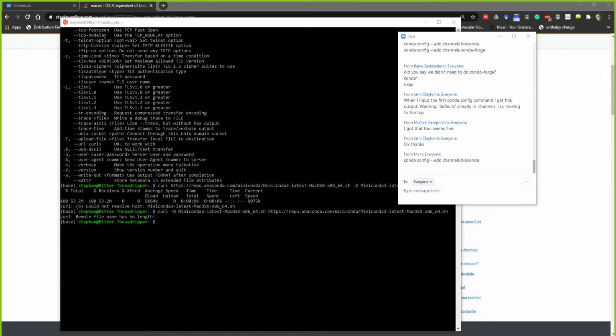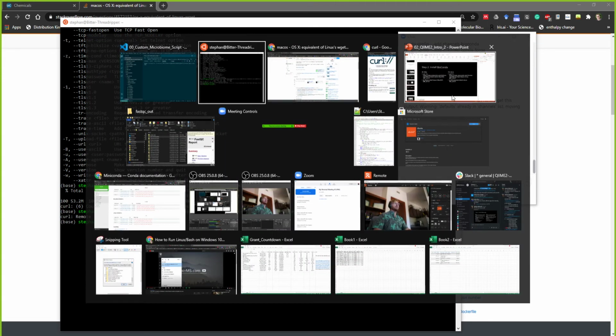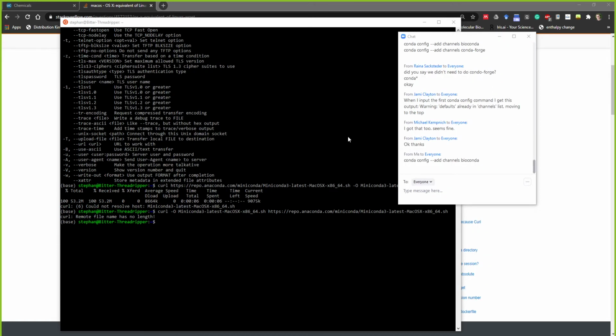Yeah, and the reason why we're doing this is because you're going to want to install other packages later. For example, you might want to work with NCBI BLAST, or you might want to work with Cutadapt on its own, or in other sorts of configurations. And for that, having BioConda installed will make it very easy for you to install those files.